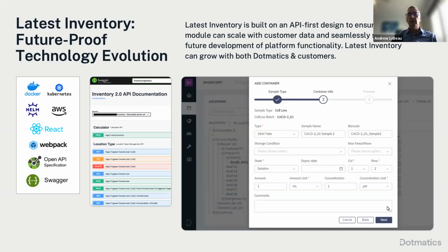We're isolating that from, for example, the UI, so that our ability to continually refresh and keep the UI looking modern is much simpler in the future because we have that separation. It means that as technologies that we are currently using to support the system continue to evolve, and people adopt new technologies, again, we can swap those out much more easily with this API-first approach.